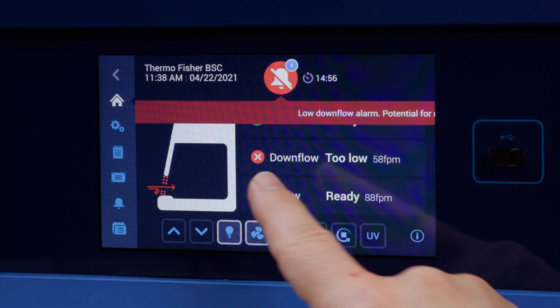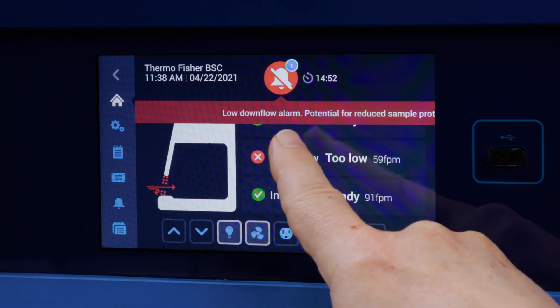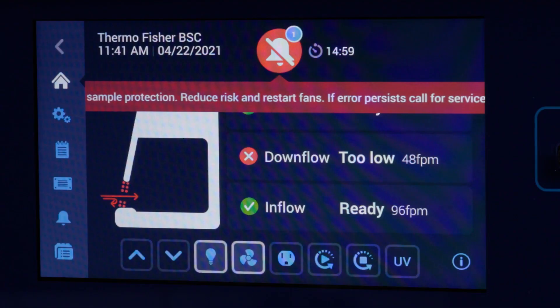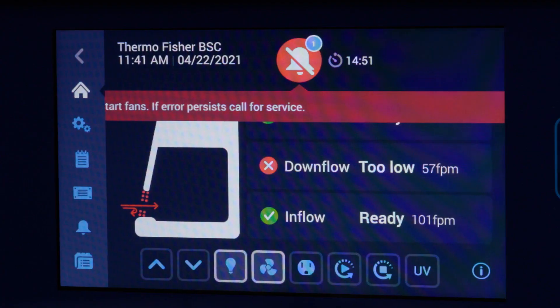It's saying 'low downflow alarm — potential for reduced sample protection,' and it's scrolling across saying 'reduced risk and restart fans, and if the error persists, call service.' So it's telling you exactly how to respond to the problem.